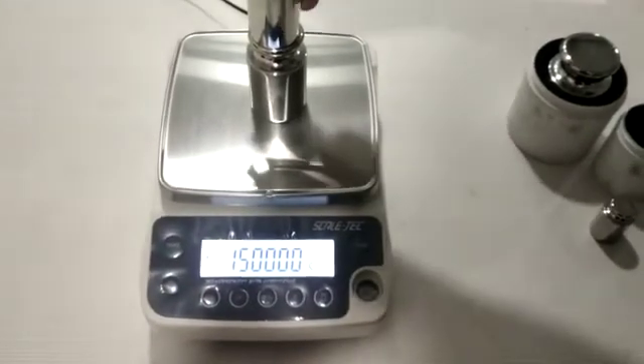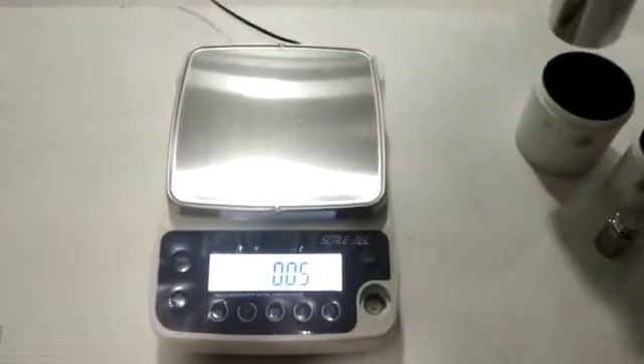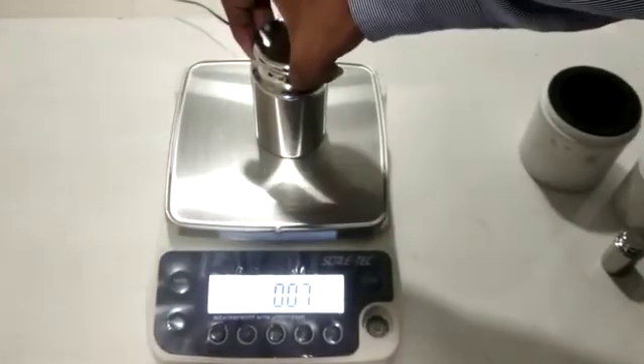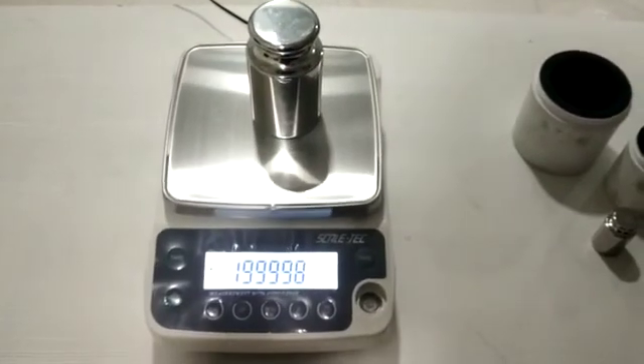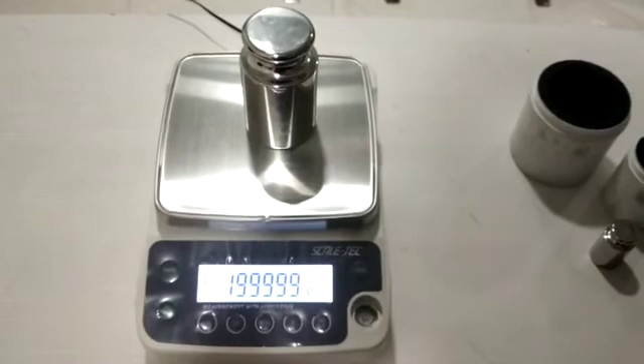Then after 1.5 kg, after that 2 kg, and at the end 3 kg.